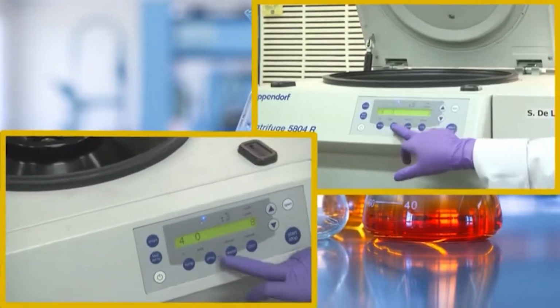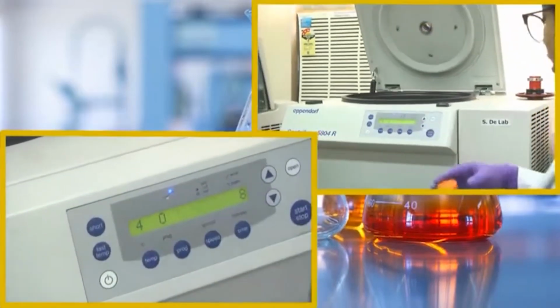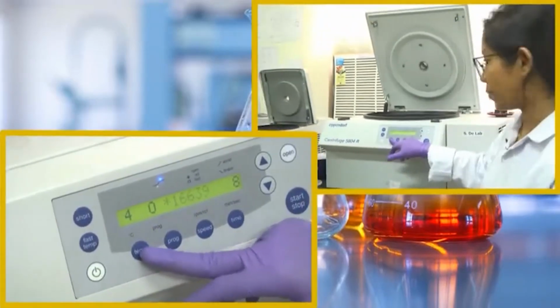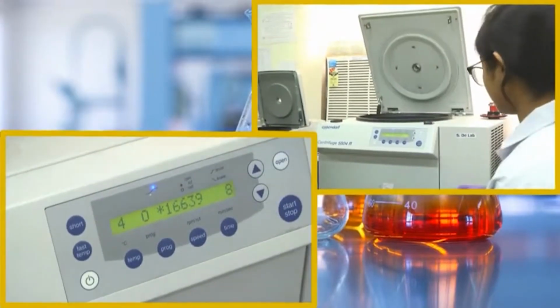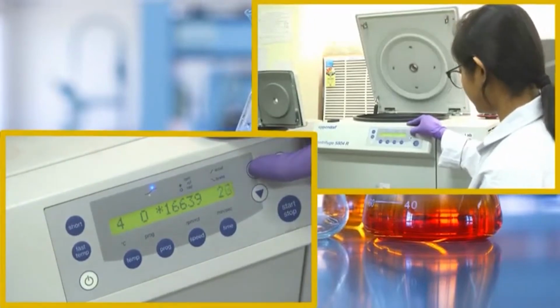So, this is 11,000 RPM, basically it is 16,000 G value, and the temperature we have set at 4 degrees centigrade, because proteins are mostly stable at low temperature. If you do not require that, you can omit that as well. You can go for 12 degrees or a lower temperature as well, and the time we will go for, let us say 40 minutes.